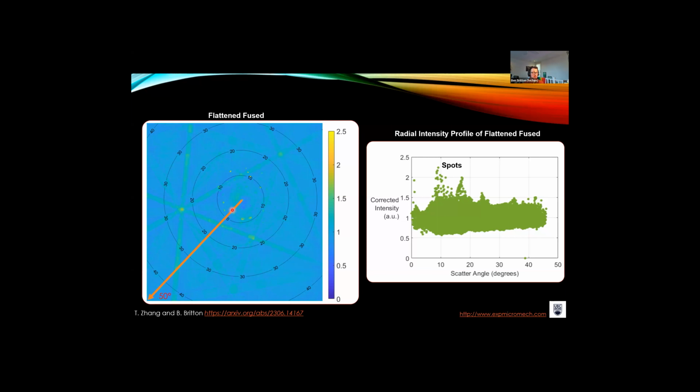because you're only seeing perhaps 5 degrees, you need to shoot along 2 different zone axes to work out the length of A, B, and C, and the angles alpha, beta, gamma. In here, we're now seeing effectively the whole crystal in one shot. And that's particularly powerful if we want to work out the structure of that material. And what's really nice, we have the spot and the diffraction pattern to work with, depending on our analysis approach.